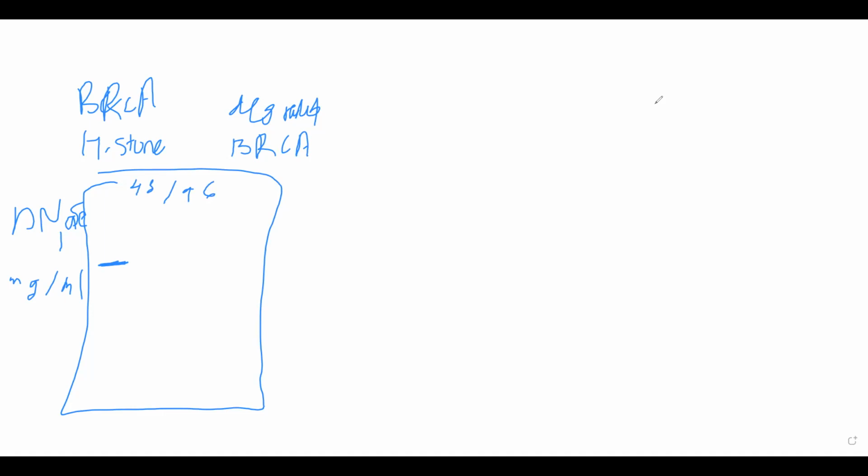On the other side, with the degraded BRCA, we will see it looks like this. It's dotted, which means it is chopped. Basically, the degraded BRCA will be chopped up by DNase 1. And from this test, we can conclude that there is an actual presence of the gene, since it was degraded, and this is how we see it in here.